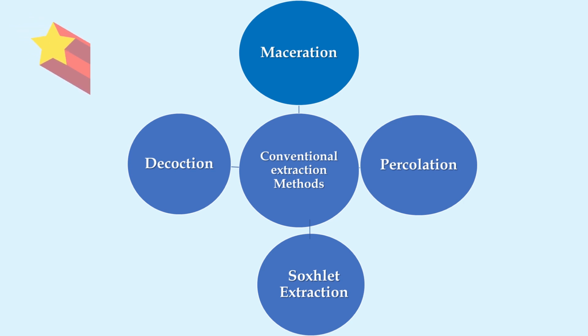An additional menstruum is added to form a shallow layer above the mass, and the mixture is allowed to macerate in the closed percolator for 24 hours. And this percolation is a continuous flow of the solvent through the bed of the crude drug material to get the extract.